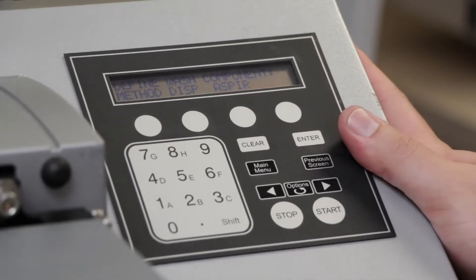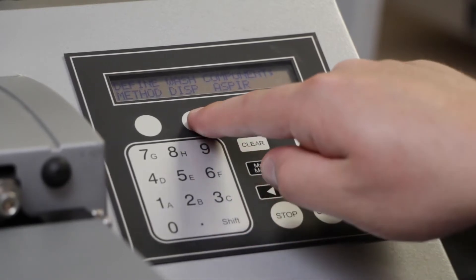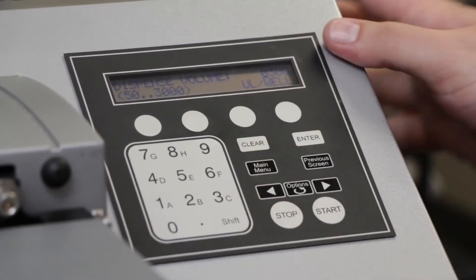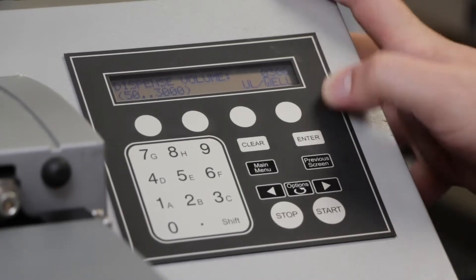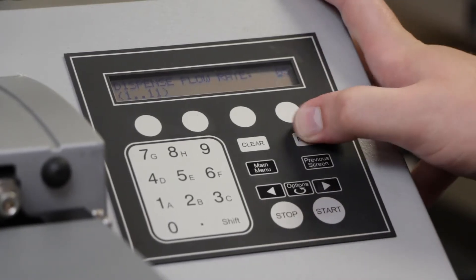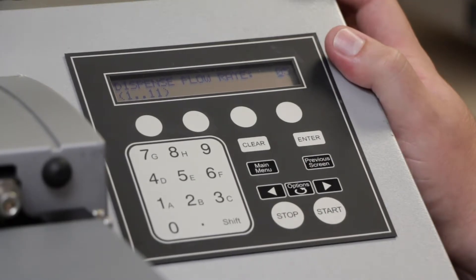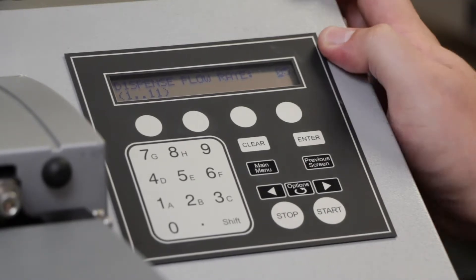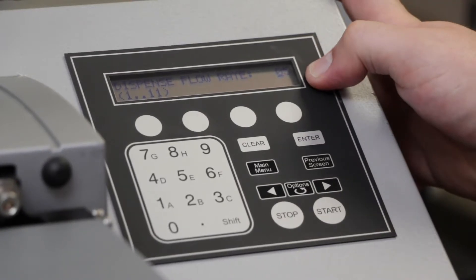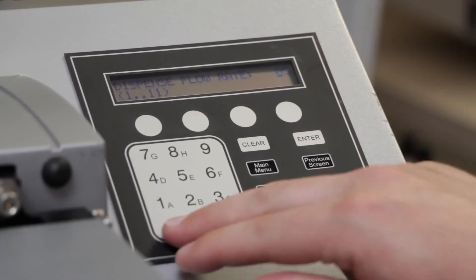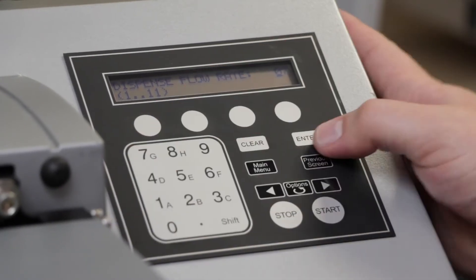Next, we'll define our Dispense step. Selecting the button under Dispense, we can select our volume for our 96-well plate. In this case, we'll use 300. Dispense rate options will vary by washer model. CW options will be denoted by a CW, immediately below the numbers. In our case, we'll wash at 7 flow rate.